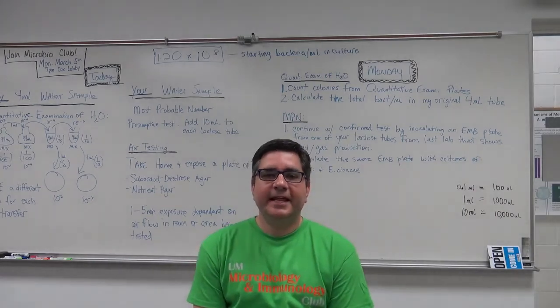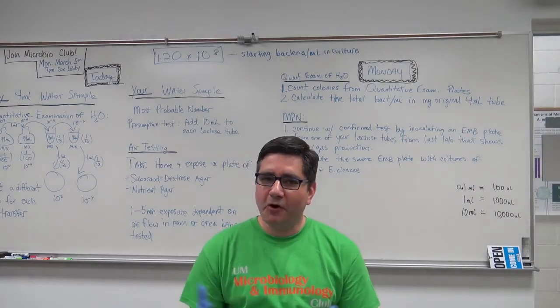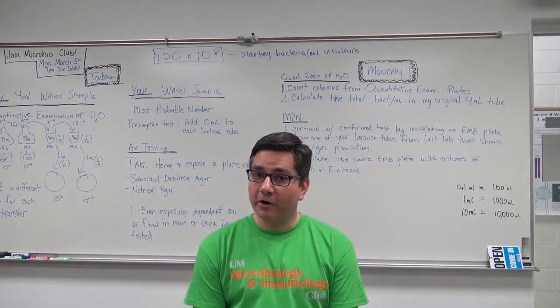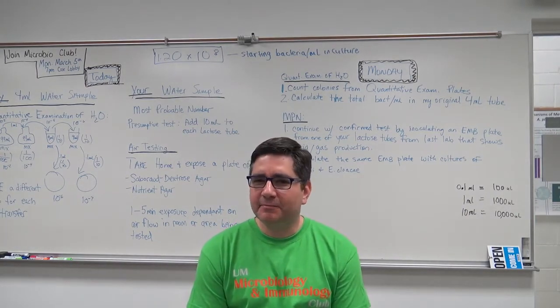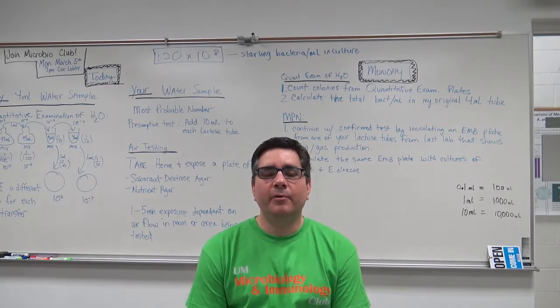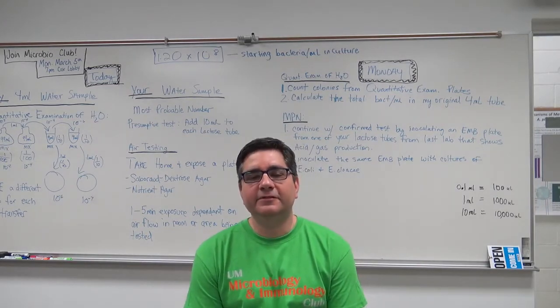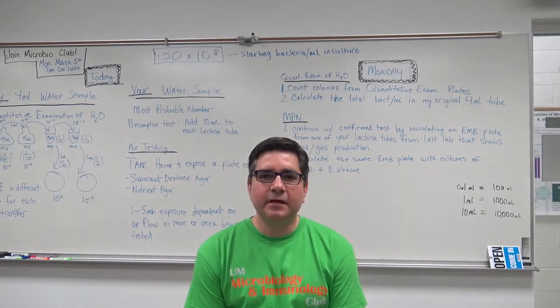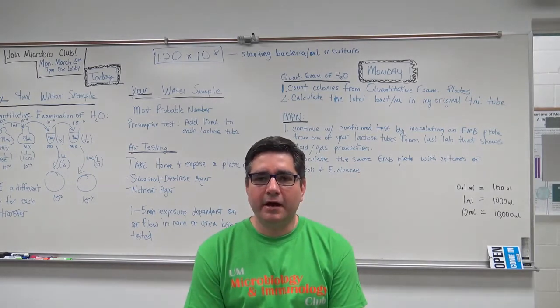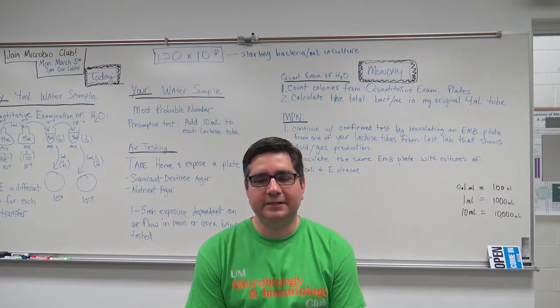The exercise for today involves two elements that we all use in our daily lives: water and air. We all use water and breathe air, so it's important for us to ensure that both of these staples of our daily lives are the best that they can be. If for some reason they are not of good quality, our health might be at risk.